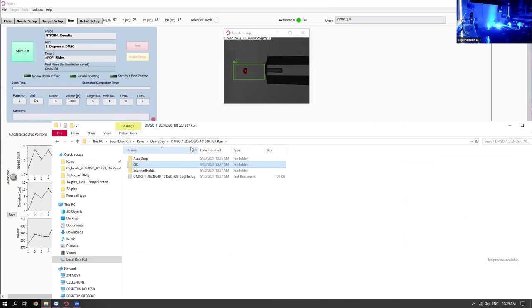And so if you want to take a look here on the deck, we have our arrays. Again, that's 384 cells worth of lysis droplets. It'll be ready for cells now.